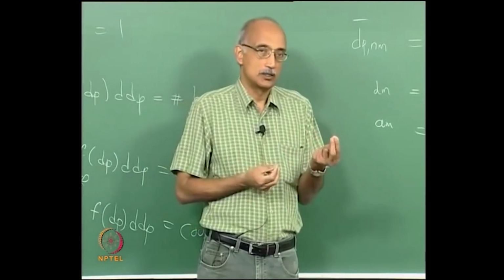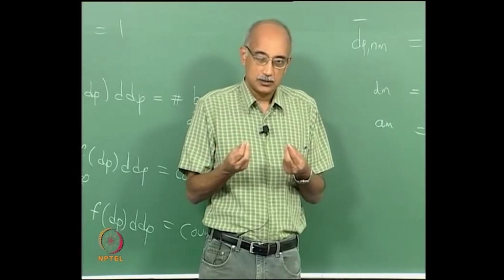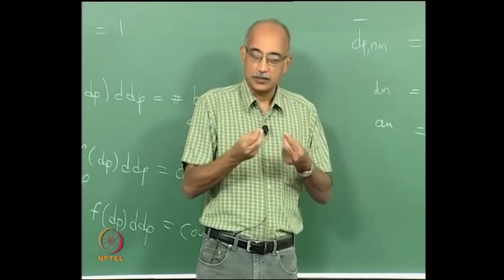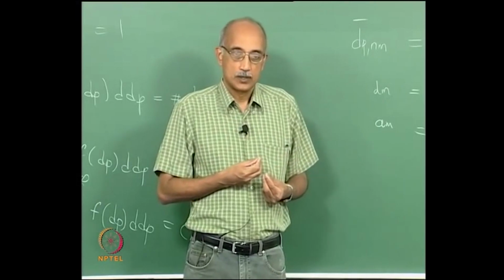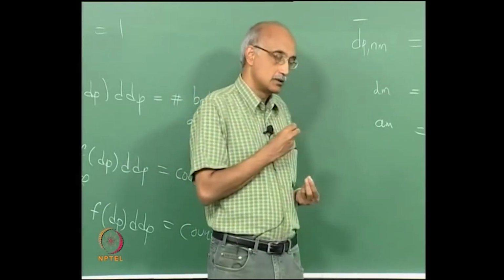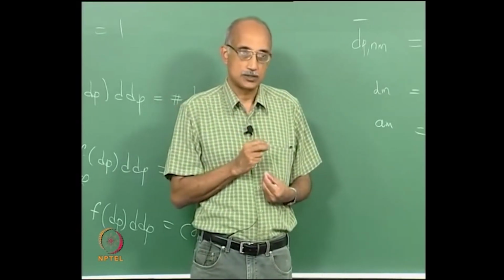But when you have oil suspended in water, let us say, the optical characteristics are not so distinctly different that you can clearly say, just based on light scattering, whether this is oil or whether this is water, especially as the droplet size becomes smaller and smaller. And so in such cases, you really cannot use light scattering as a technique to measure particle size distribution.